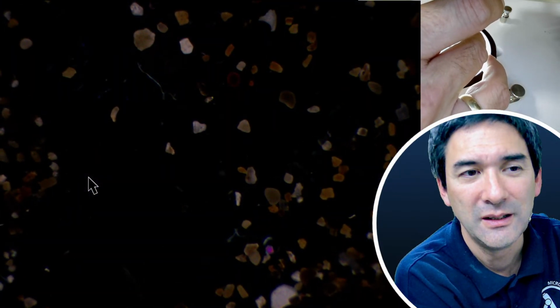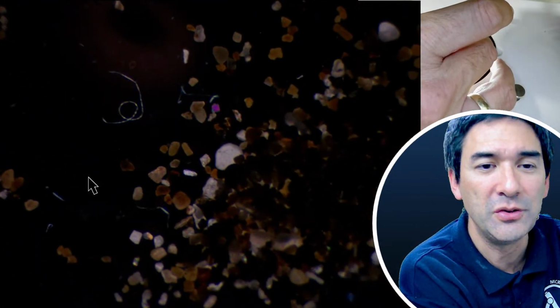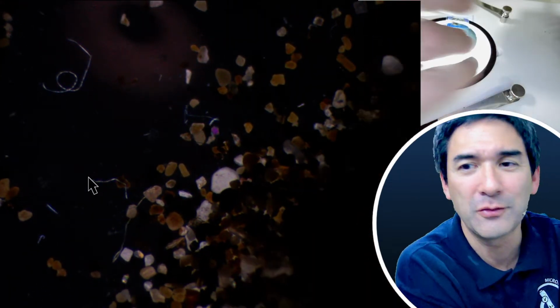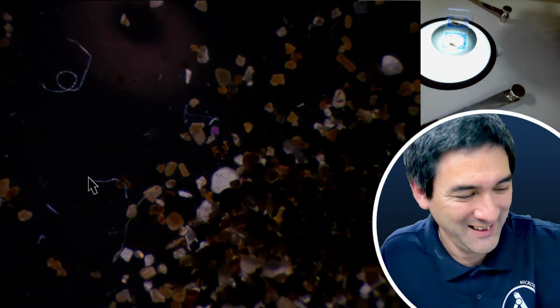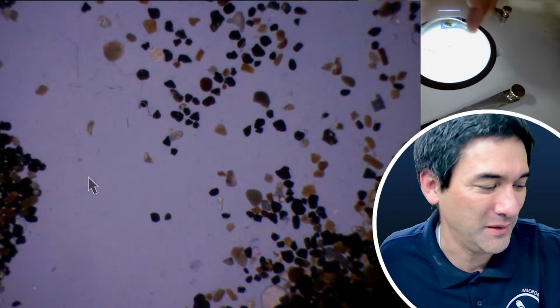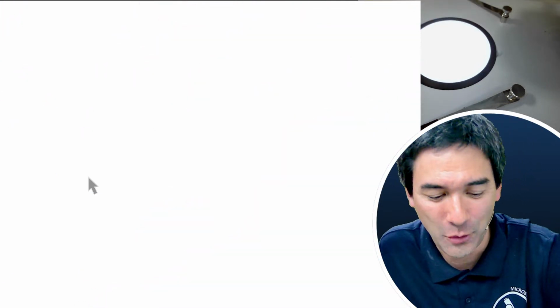Yeah. There are plenty of things to play around with. One of the things that I've also tried to do once, I think, is of course you take pictures of this, then you have nice microscopic artwork. But that is a little bit playing around with some sand. I can highly recommend to expand your observation range a little bit. Of course, observing water samples and so on is a very fun thing, but there are so many other things as well.